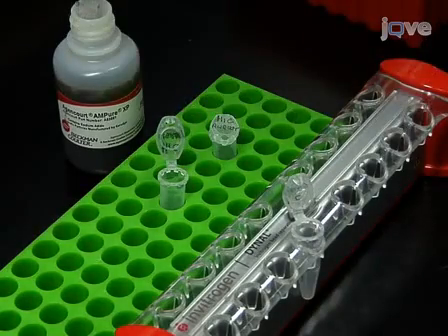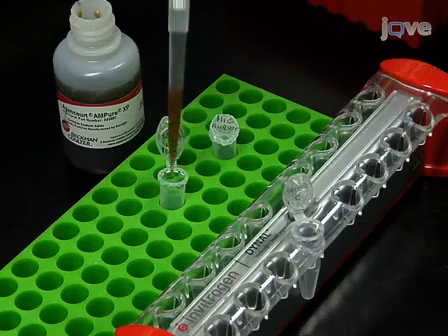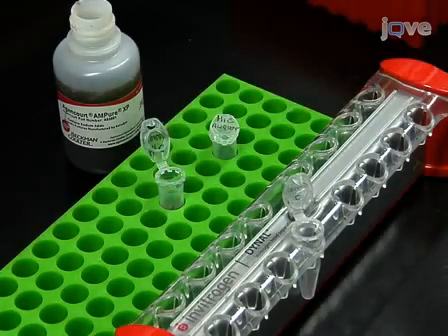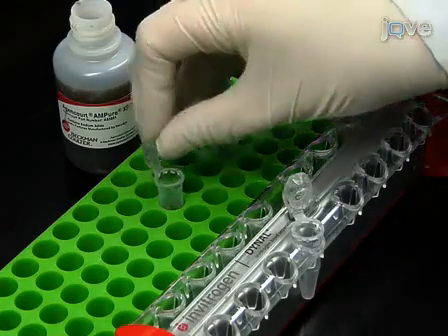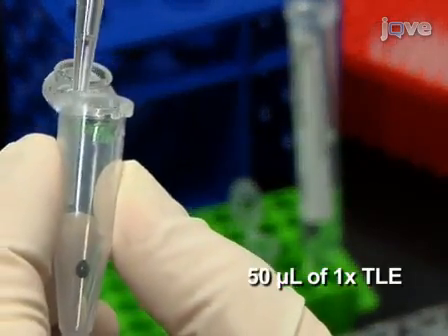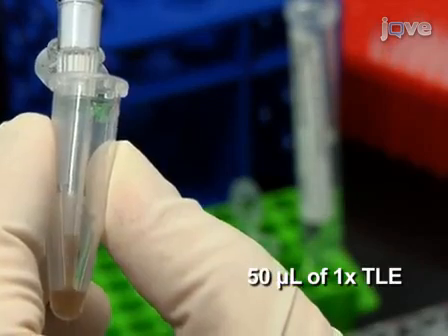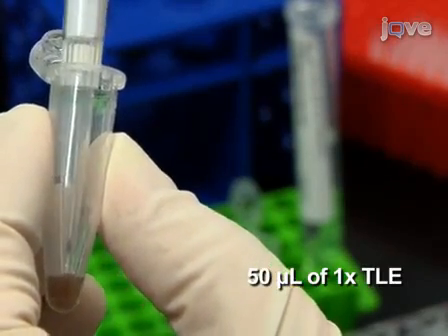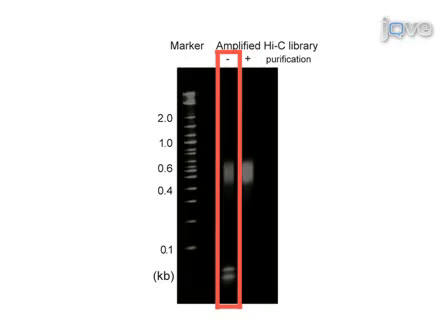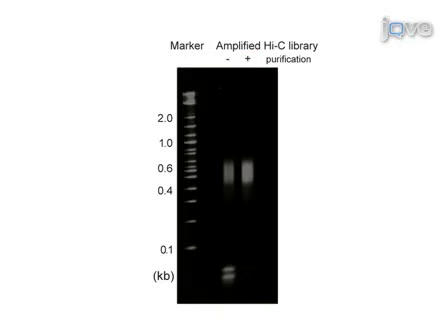And purify the remainder of the PCR product with 1.8 times volume AMPure beads according to the manufacturer's recommendations. Elute the DNA with 50 microliters of 1x TLE buffer and compare 1% of the AMPure bead purified PCR product to the 1% aliquot of the original PCR product on a 5% polyacrylamide gel, ensuring the successful removal of the PCR primers.